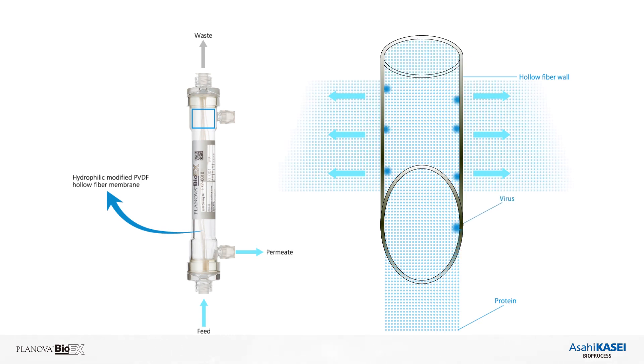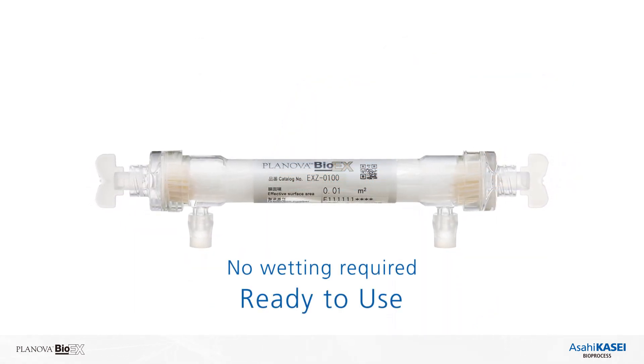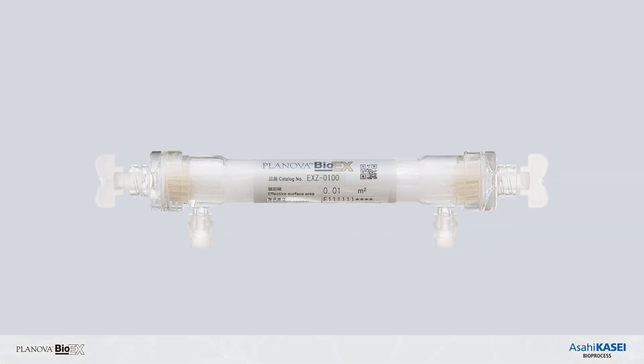Planova Bio-EX is delivered to you in a sterilized condition with fill water, so you can unpack the filter and it is ready to use for a pre-use integrity test.